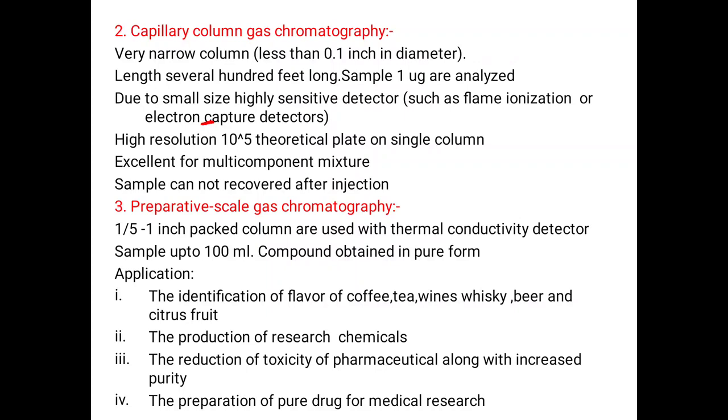The method is capable of high resolution, on the order of 10 raised to 5 theoretical plates on a single column. Therefore it is excellent for multi-component mixtures and very nice for their separation. However, the sample cannot be recovered after injection, which means that once the sample is injected, it is lost during the process.